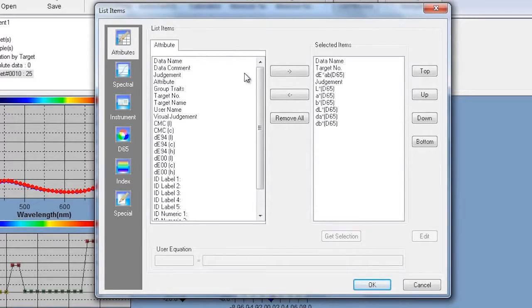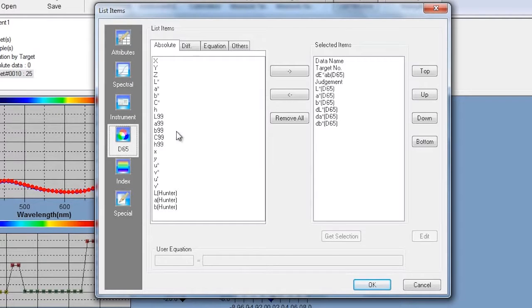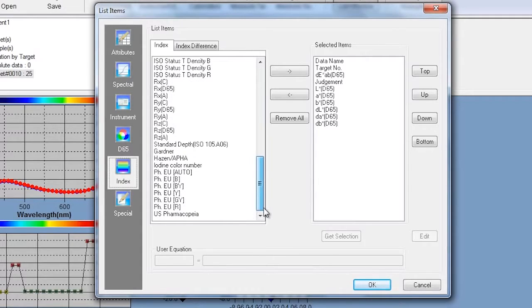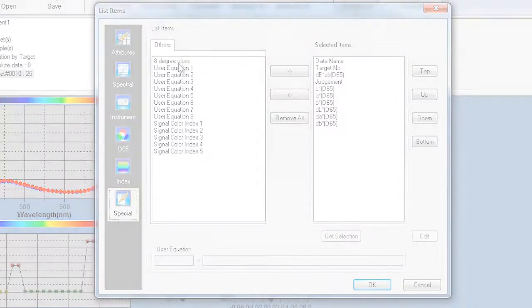With SpectraMagic NX, you can measure samples in any of eight universally accepted color spaces. Select from 16 illuminants and up to 40 indices to determine specific color and appearance properties such as strength, brightness, haze, yellowness, opacity, and whiteness. You can even configure up to eight customized color equations.